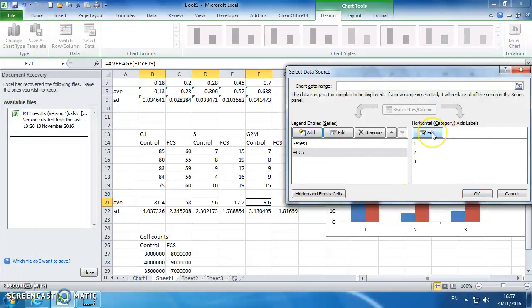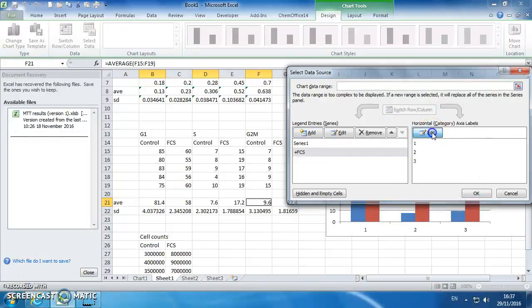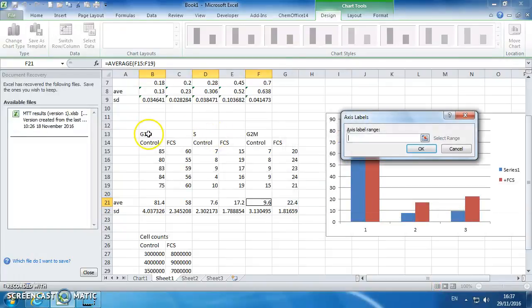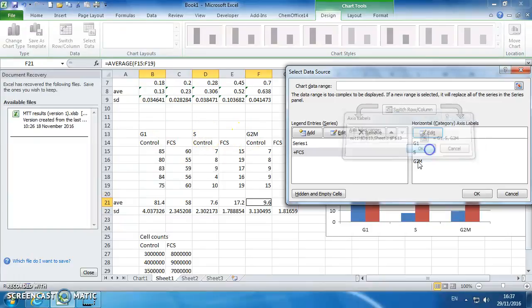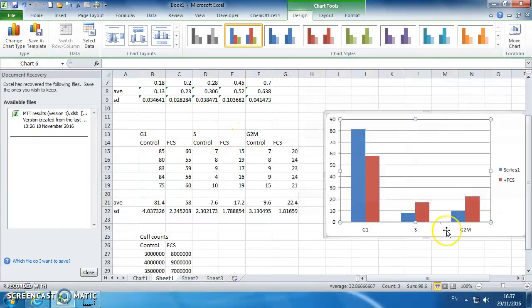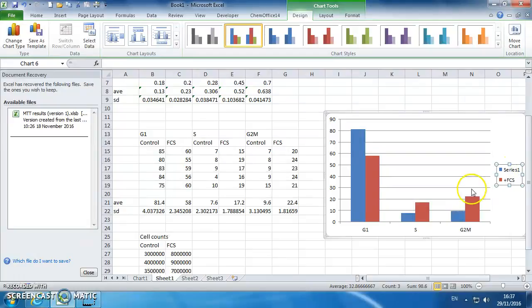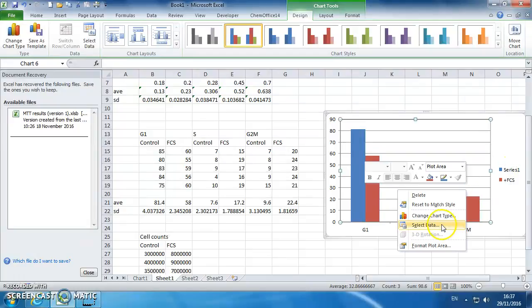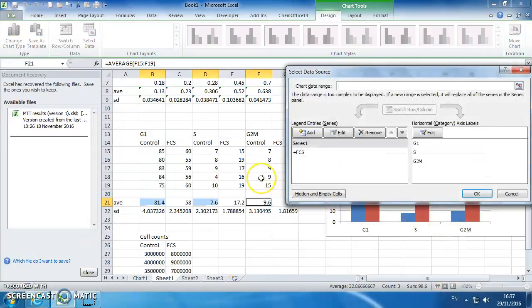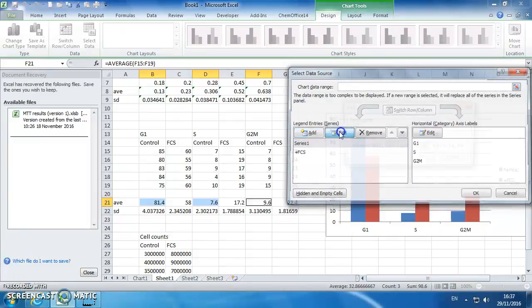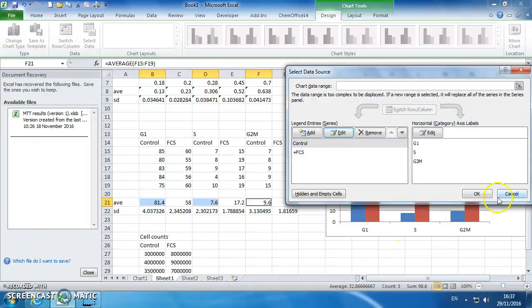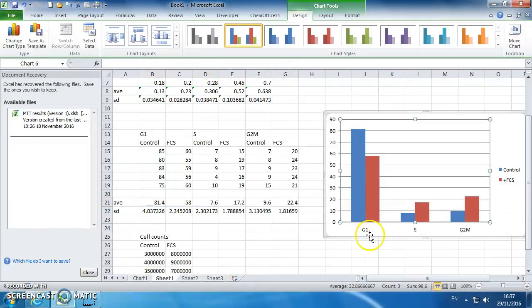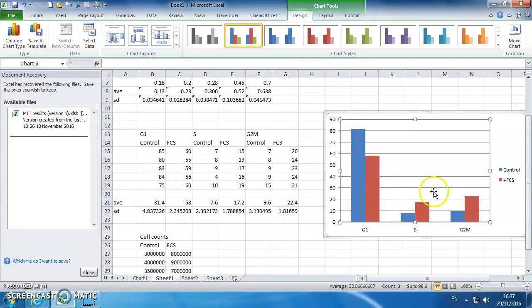We can edit these. Okay, and then we can rename series one by editing it and just call it control. So we've now got a nice pretty graph showing that data, so that's your flow cytometry data.